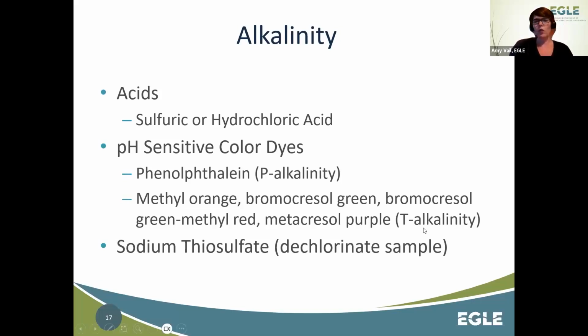If you're looking for total alkalinity, there are other indicators. There's methyl orange, which turns from orange to pink. There's bromocresol green, which turns from green to purple or purple to green. I can't remember. They just turn different colors, reds to purples, purples to reds. You just know what indicator you're looking for. Some are real difficult to tell a color change because is it red? Is it purple? But after time, you kind of get the hang of it.